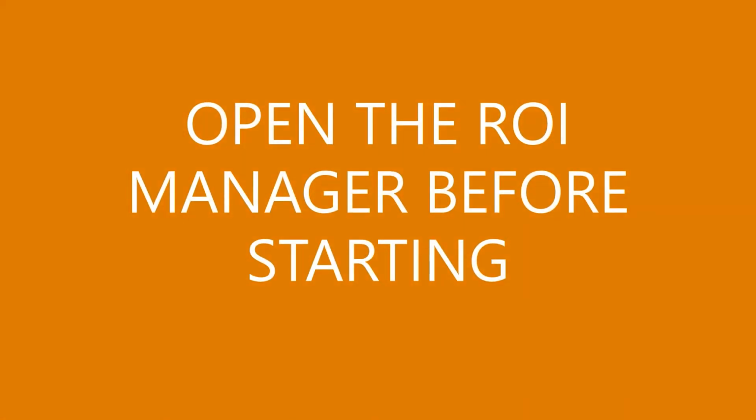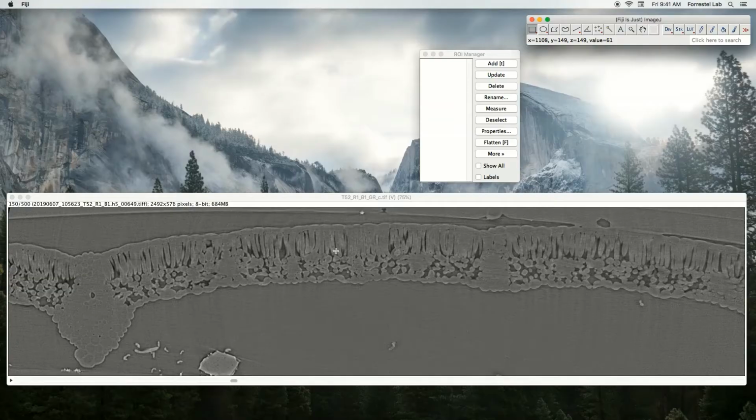The first measurement we need to take is the whole leaf. So open the ROI manager, use the polygon selection tool, it's a freeform selection, and carefully draw along the outline of the leaf.